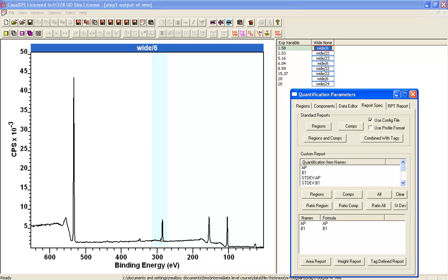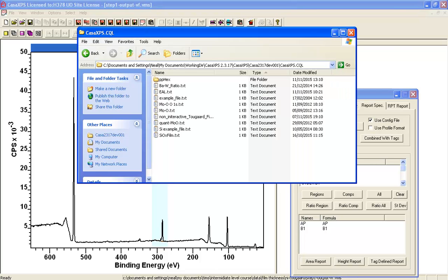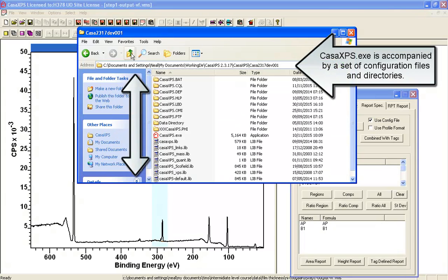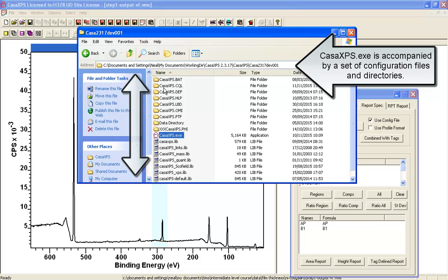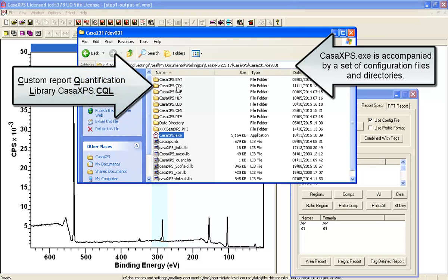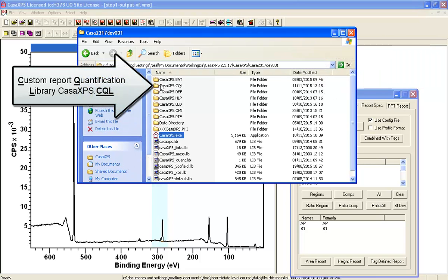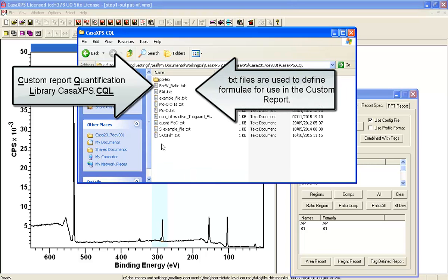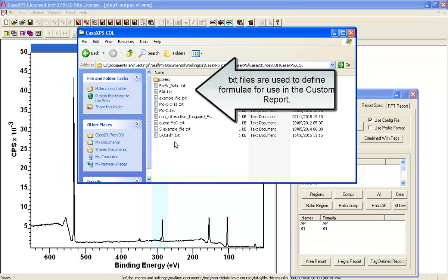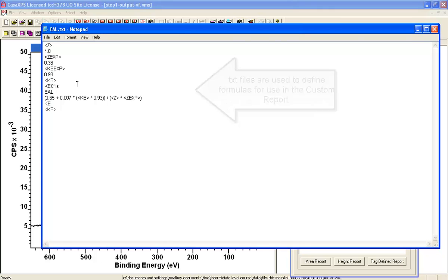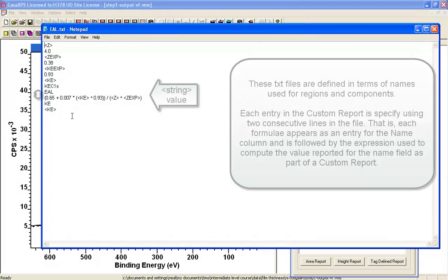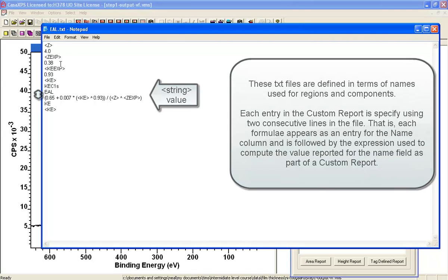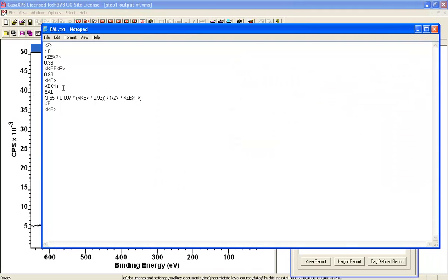To do this, we're going to go to the directory where the CASA XPS executable is located, and there's a CASA XPS dot CQL directory which contains a set of files here which are txt files, and these represent examples such as this one here of how to calculate the effective attenuation length, in this case for carbon 1s.